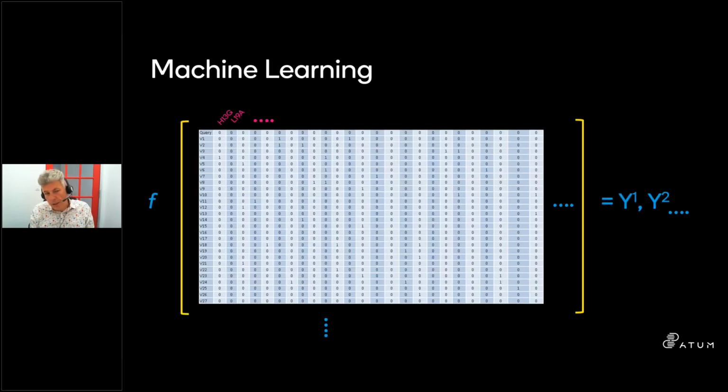Then we set up the machine learning, and this is a very simplistic DOE. This is just the top left corner of a big matrix, which really is 96 rows. Each row is one antibody. In this case, I think we're looking at say 70 or so columns, and every column is one substitution. For instance, in the top left we're looking at H13 to G, and the second substitution is L19 to A, and so on and so forth. Every time there's a 1, that means we're introducing that substitution.